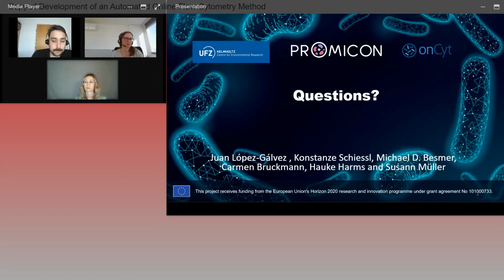I don't know, Juan, what do you think? Yeah, most of the time, a strain in a community will appear in a Gaussian distribution. So it's easy to determine this from any background noise in your sample. Noise normally will not distribute in a normal distribution. So it's easy to differentiate what is a bacterial strain present in your community from what is not.